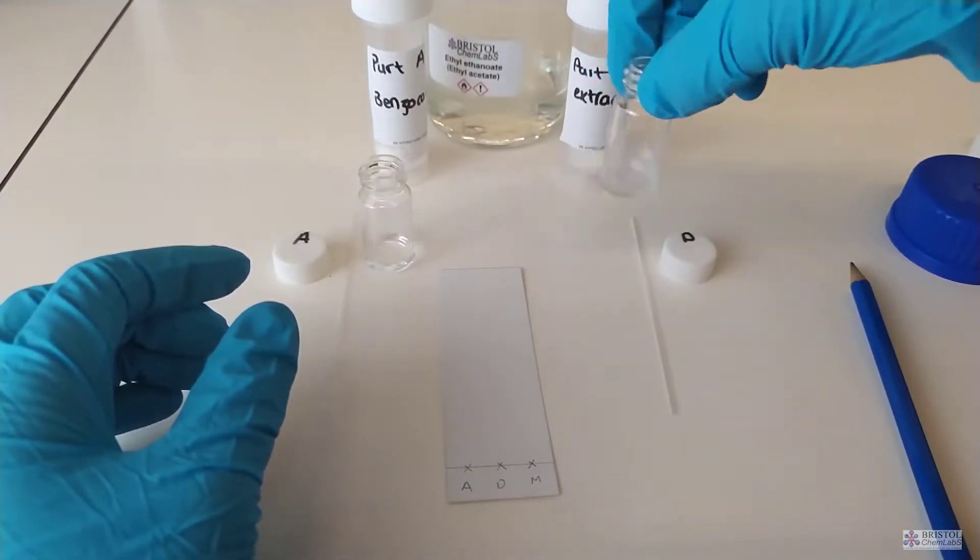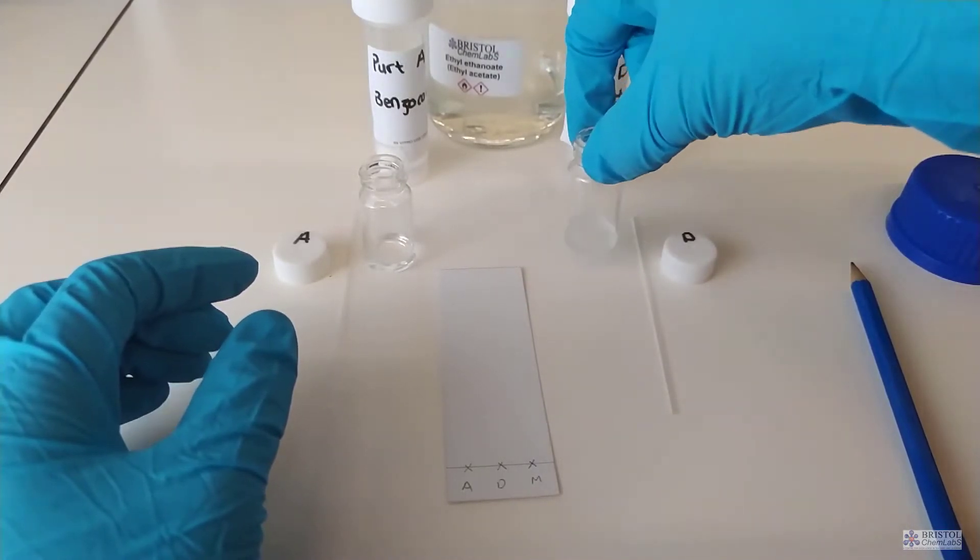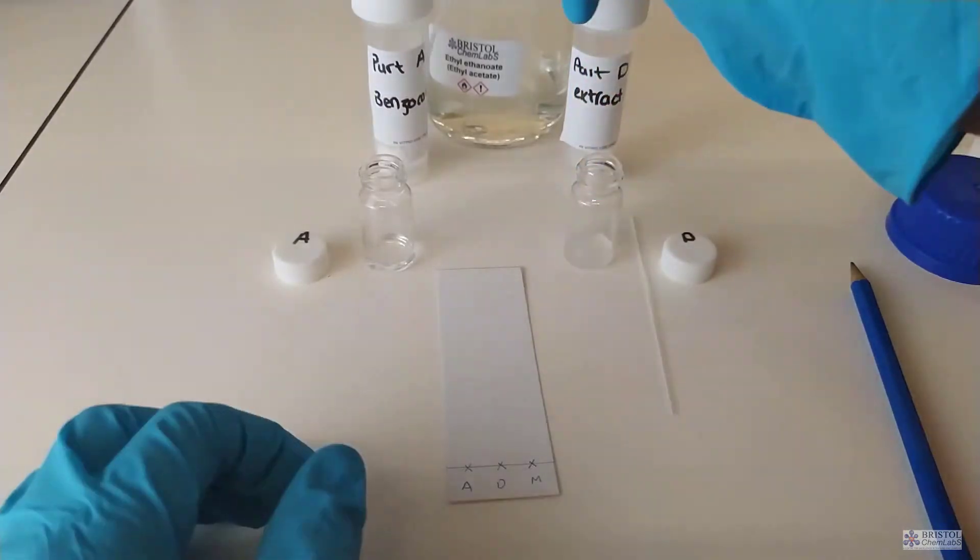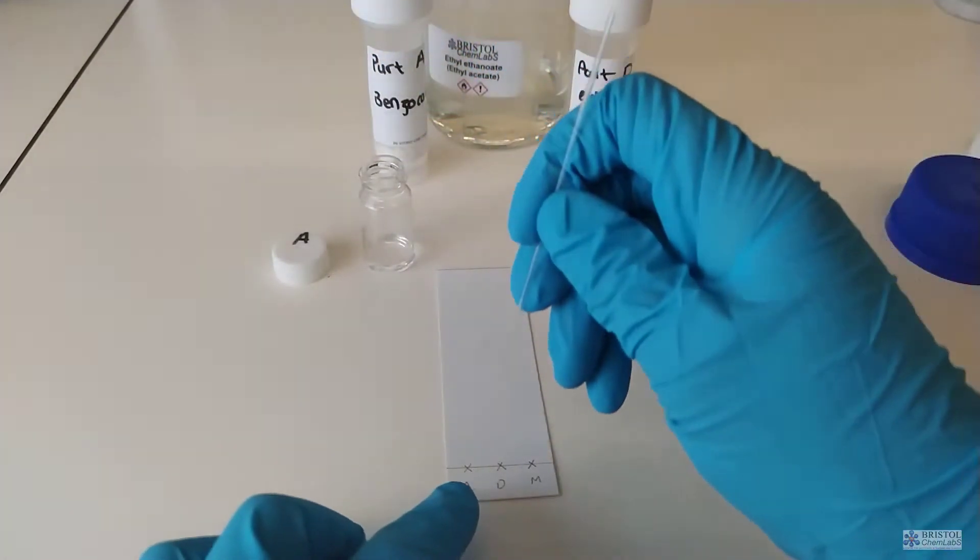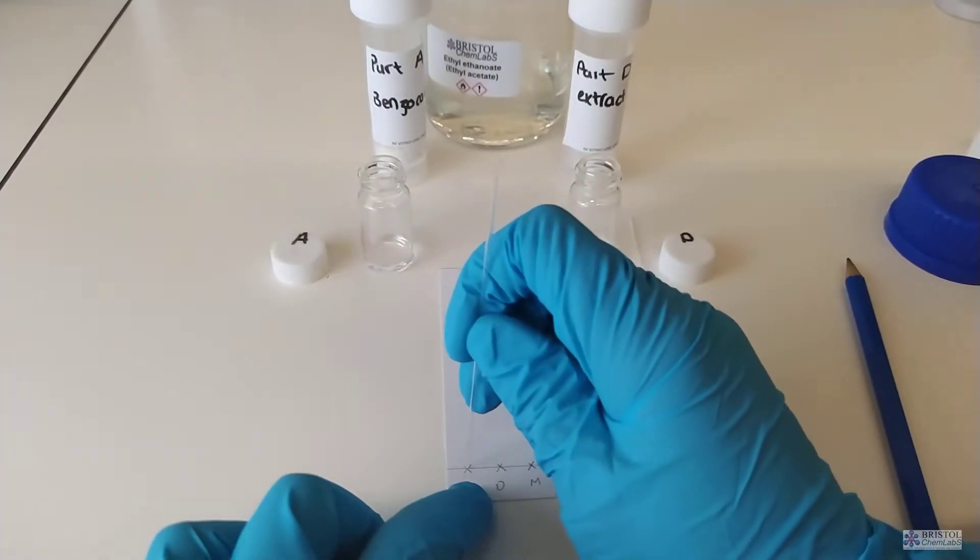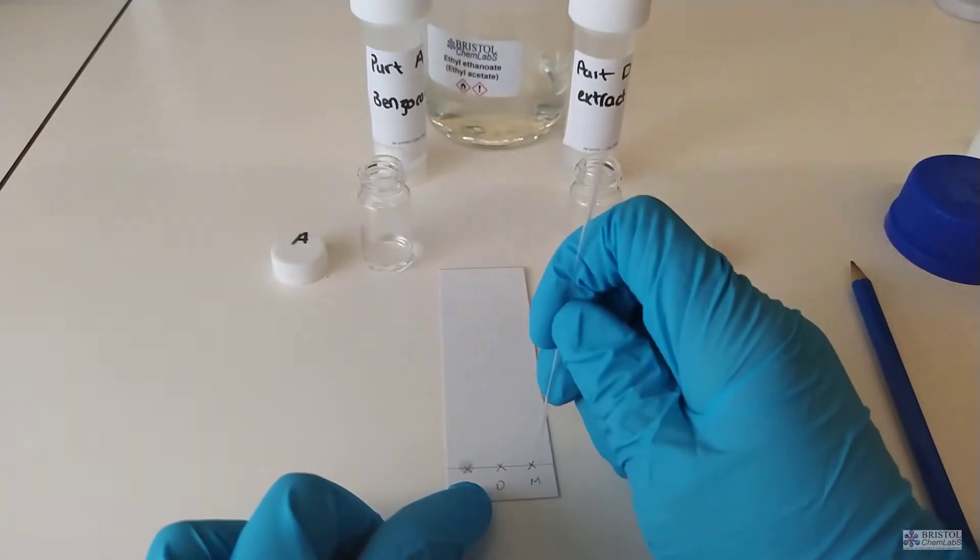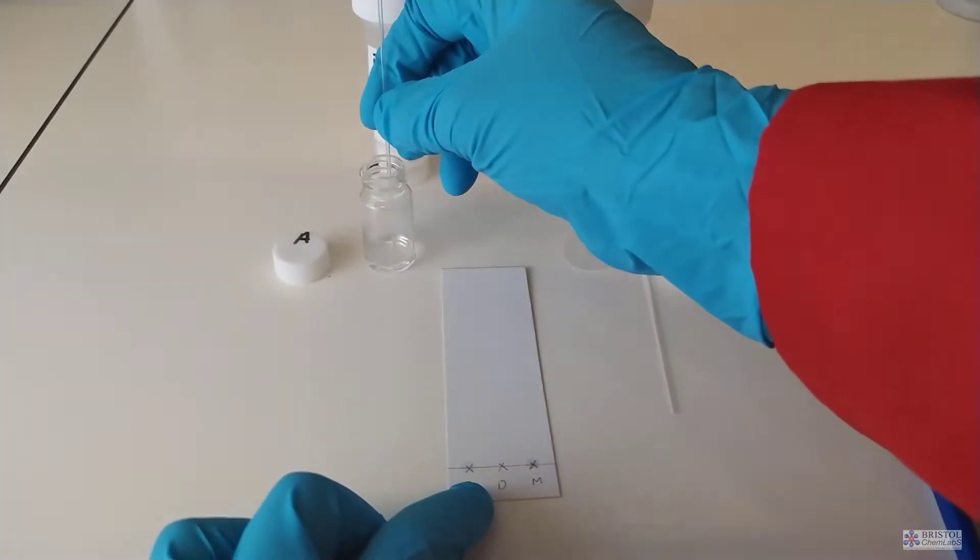We use a capillary tube to apply small amounts of the solvent solute mixture to the markings on the plate. We put several layers one on top of each other and try and make the spot as small as possible. We don't want large blobs because it leads to inaccuracy if we were doing measuring of RF values.